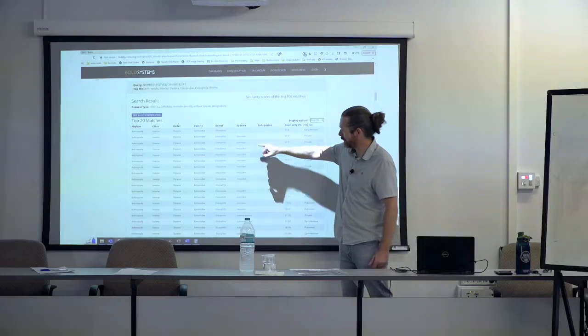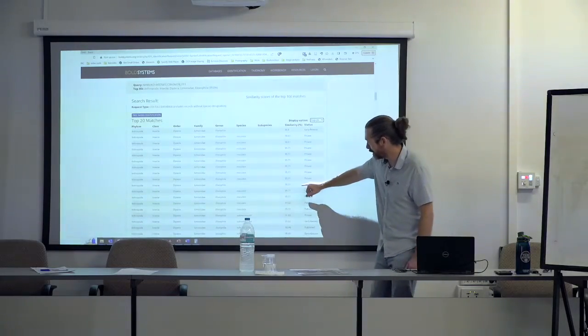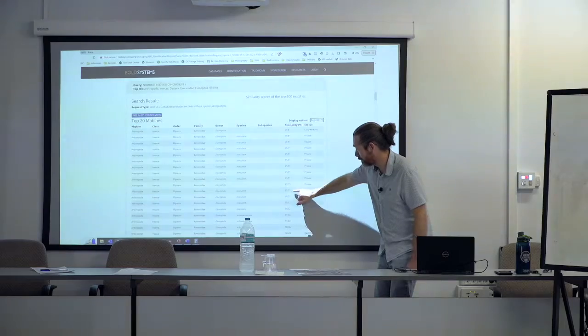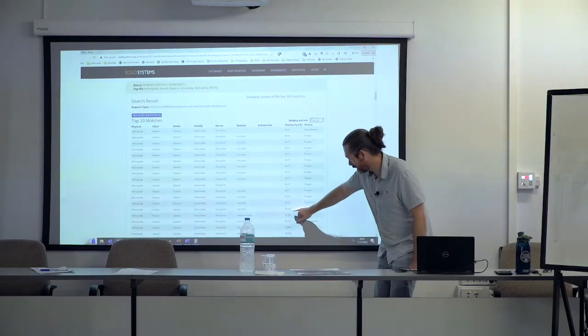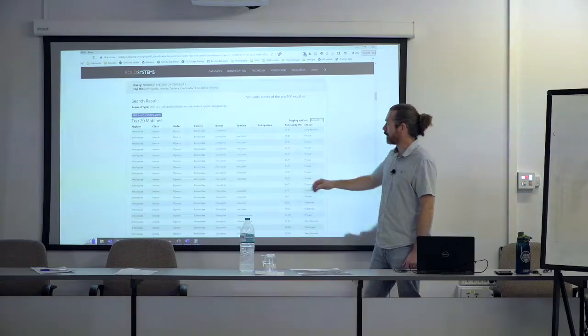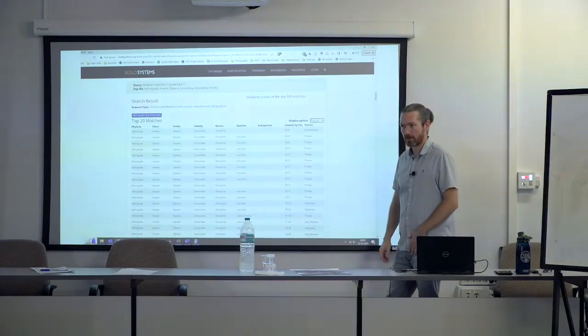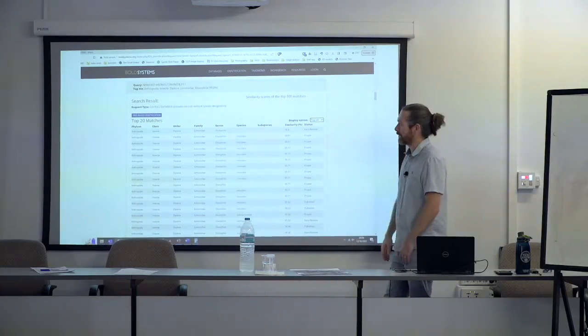So you could be quite confident that it's probably that species maculata, because the next species, well, there's a couple of 95s to maculata and then a couple of 91s to other species here. But I would be relatively confident that maculata is the correct thing, and especially if that's what the taxonomist said, you'd be happy giving it that name.